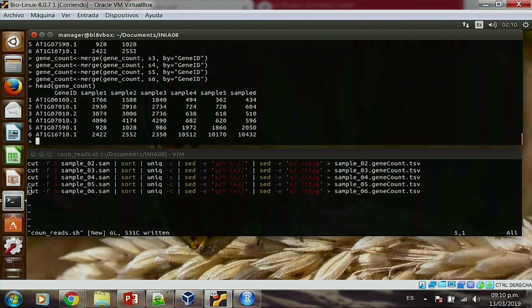Now, be aware, I didn't explain this before. First of all, this is just simulated data, but this is something you would expect in the real world as well. This belongs to 3 repeats and 2 treatments. So we have a control in the first 3 samples and a test, or environment 1, in the next 3. And we've done 3 repeats. Why do we do 3 repeats?